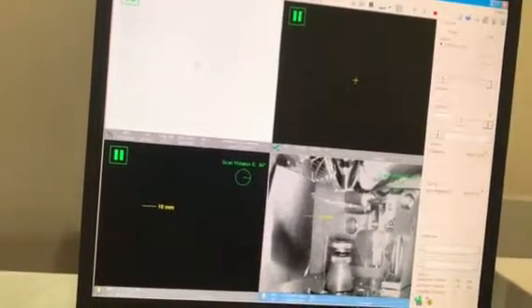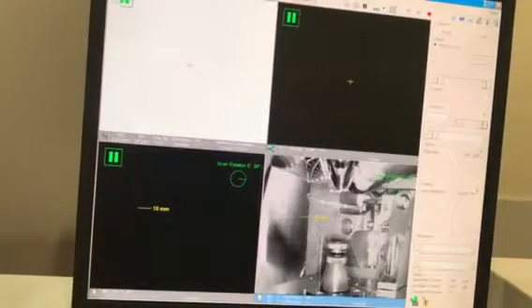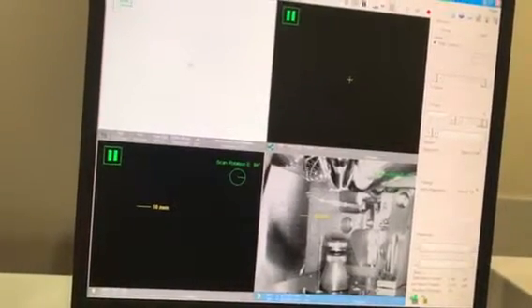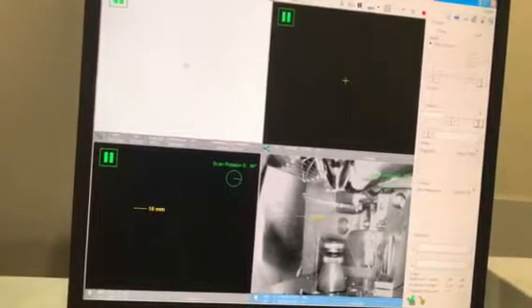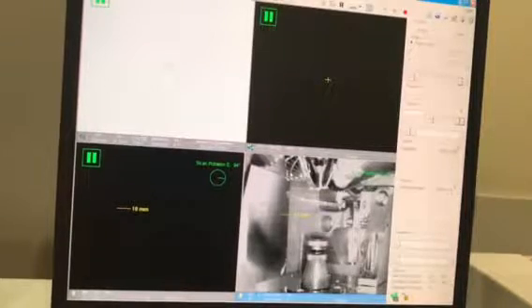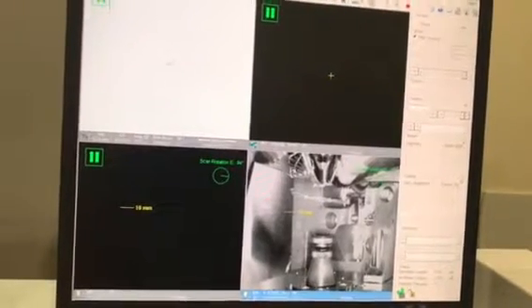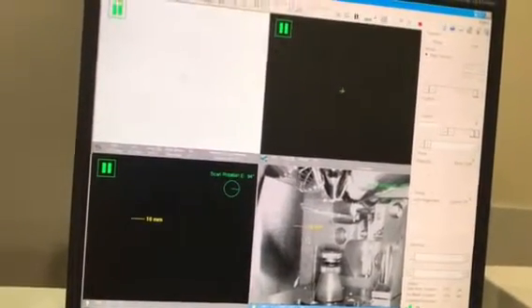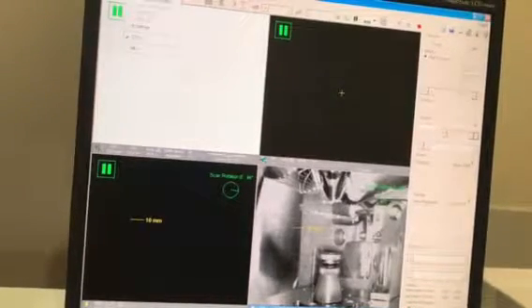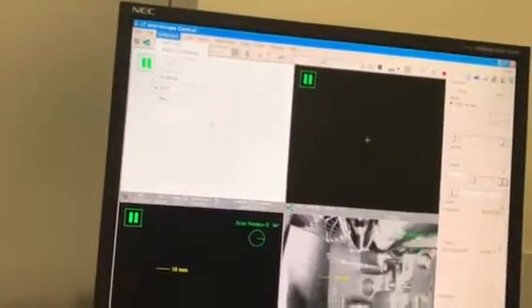Now, when you excite your sample, which is going to be installed on this stage, your secondary electron detector is this one with the cage. You can give positive or negative charges to the cage and attract secondary or backscattered electrons to this detector. This detector is called the ETD. So the detector here with the cage is your secondary electron detector, and it's called ETD.